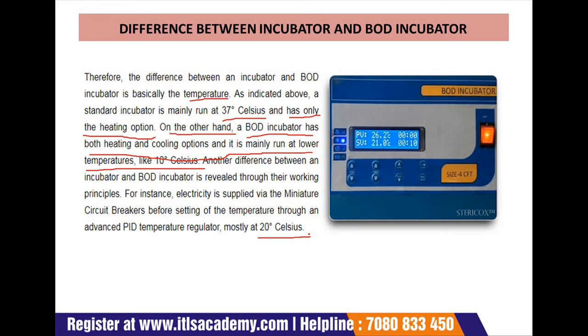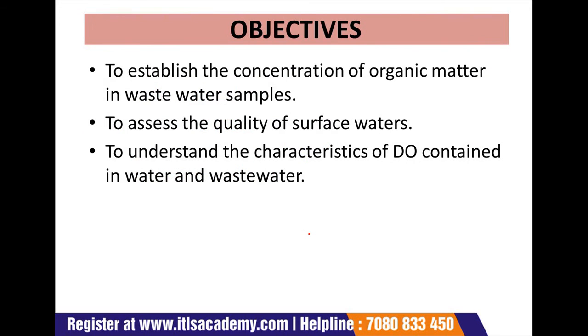On the contrary, an ordinary incubator's temperature is maintained by the compatible running of a temperature contactor, temperature controller and temperature sensor. So now, what are the objectives of the BOD?